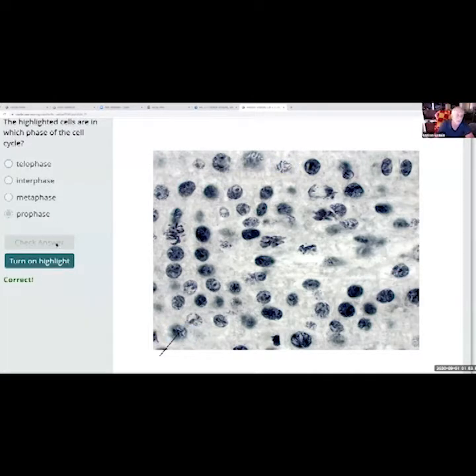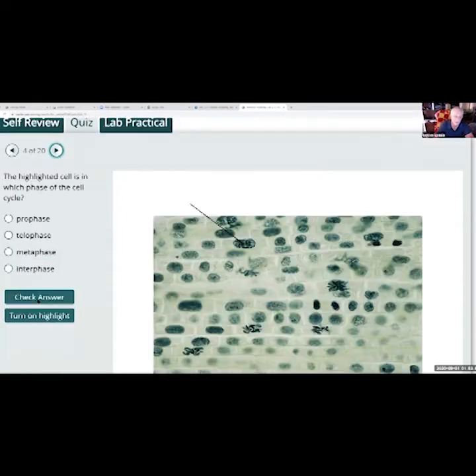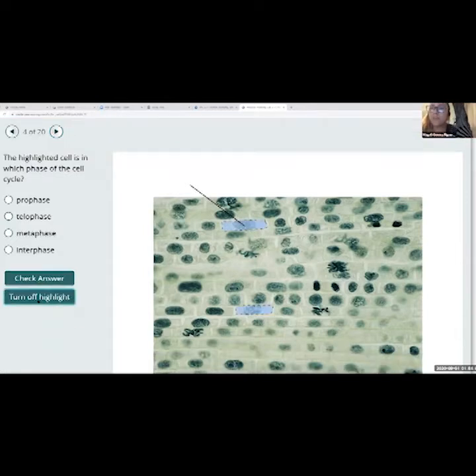All right, some more of these. Look at the highlighted cells. Those two right there. The Zoom meeting, for lack of a better term, is lagging. Your voice is like 5 seconds ahead, at least on my end. Yeah, same here. It's going faster than the slides.